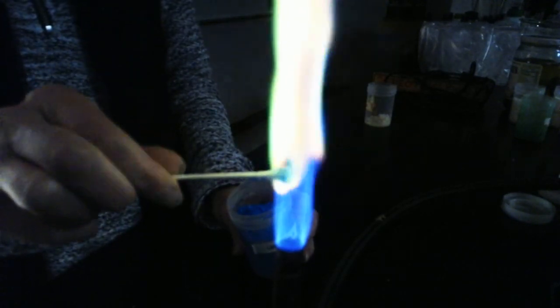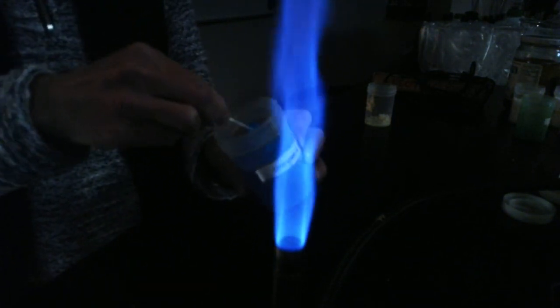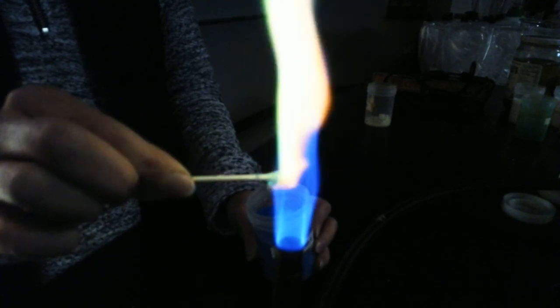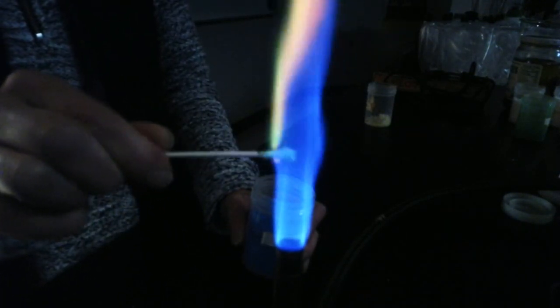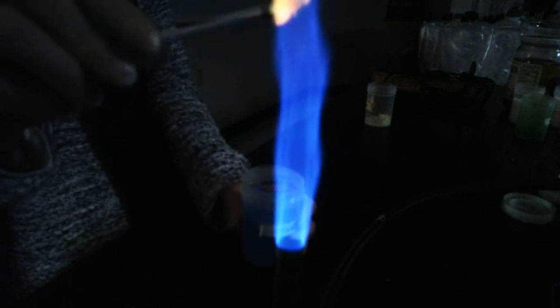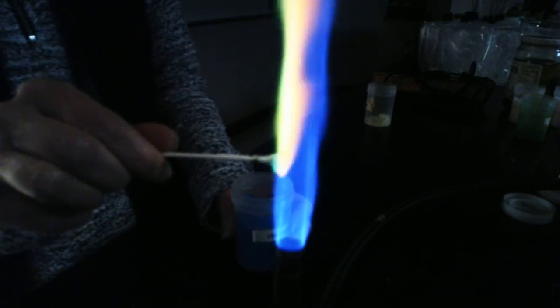It's also a greenish blue flame. It's the same flame that you get with copper chloride. So when you see two samples that are giving off the same colors here, we can assume that maybe they have the same metal. This blue one is a copper sulfate, whereas the other compound was a copper chloride, but their flame test was the same.